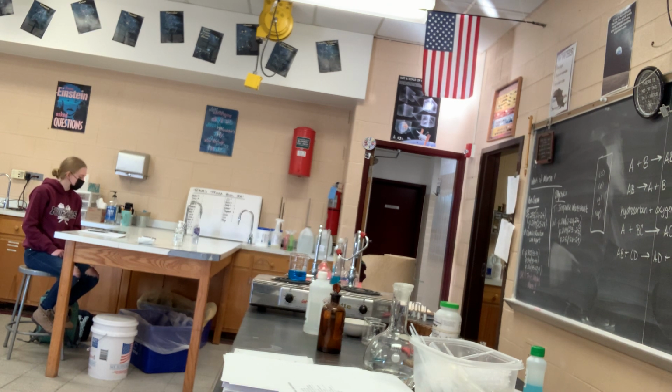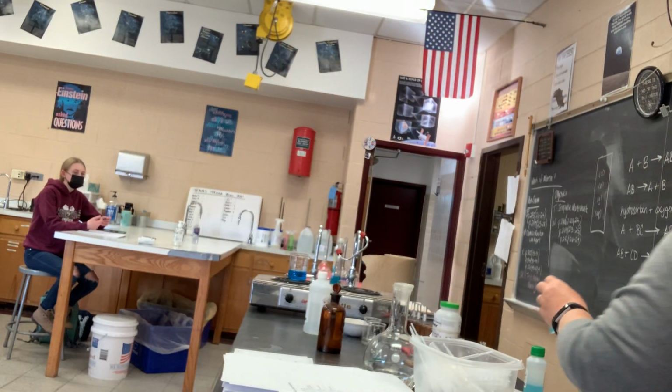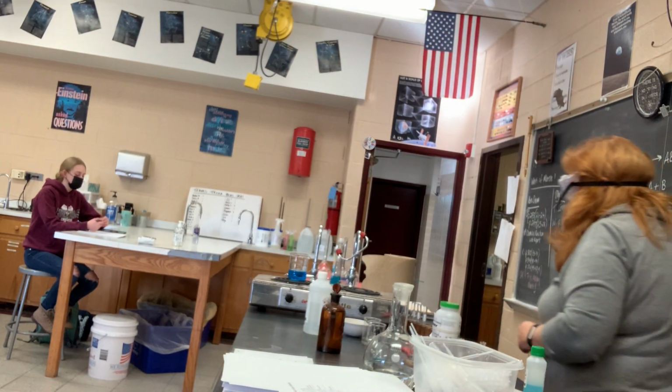And there are bubbles. It almost looks like a blue jello. But that's what it's doing. It's a gelatinous solid, a different color. So that's how you can tell that there's definitely a chemical reaction that's happened, because you had 2 liquids that became a solid. So that's all of them. The copper sulfate and the zinc. Back to this one.